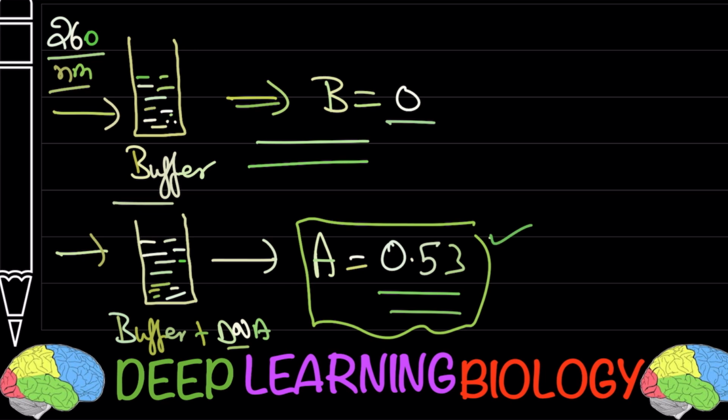Now keep in mind that in the case of DNA, we are going to calculate absorbance at 260 nanometer. This is for DNA, and this is also for RNA.